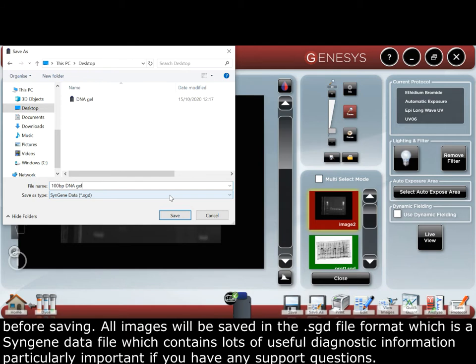All images will be saved in the SDG file format, which is a Syngene data file that contains lots of useful diagnostic information, particularly important if you have any support questions.